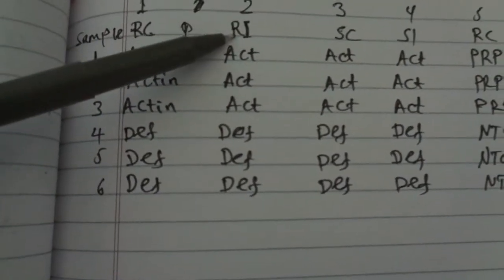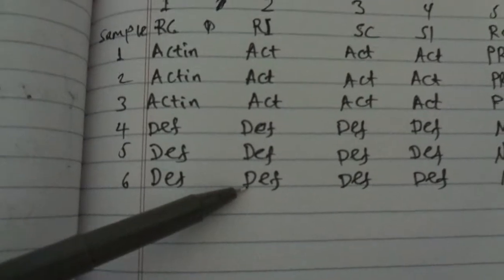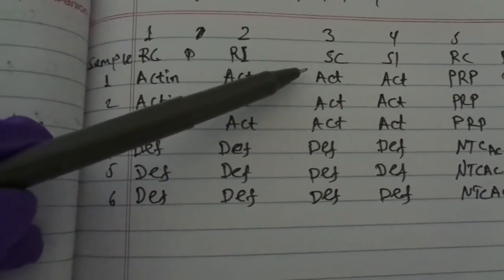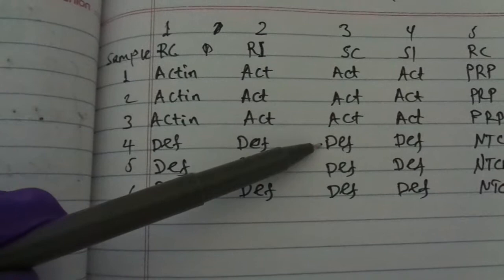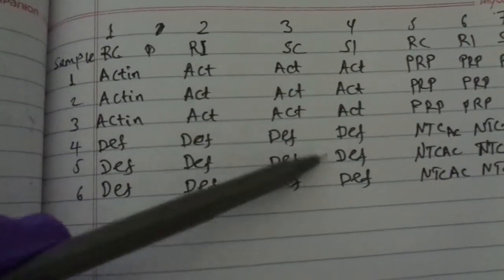Defensin gene, and also for the resistance inoculated sample there are 3 replications here. Also for susceptible control there are 3 replications, and as well susceptible infected there are 3 replications.